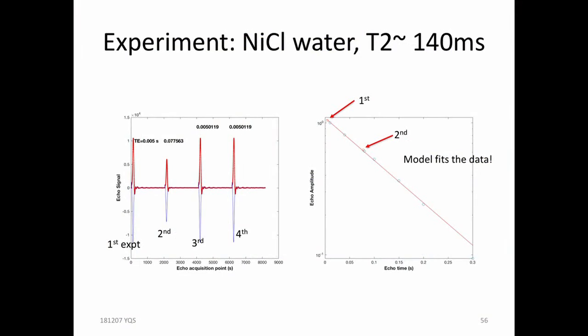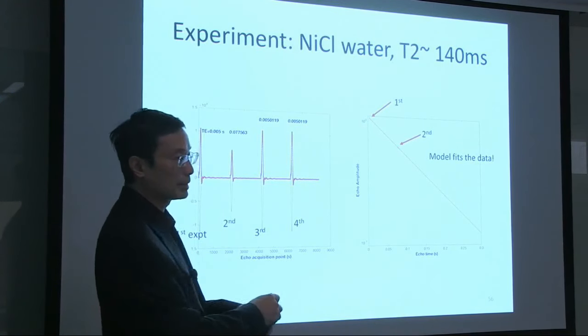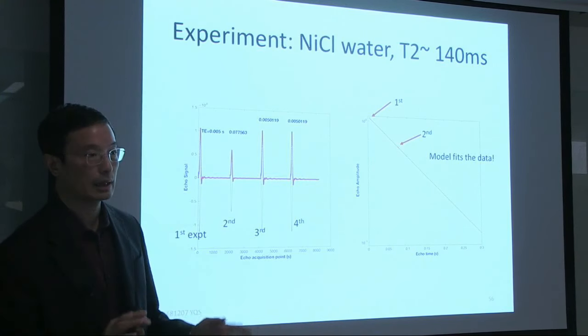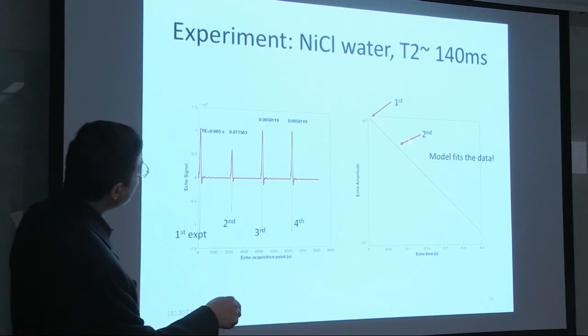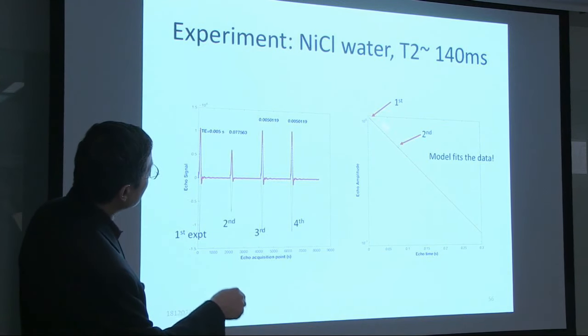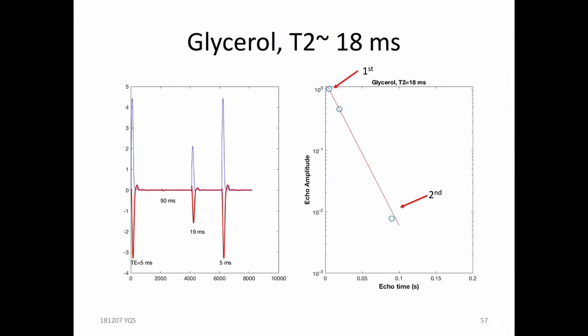And so the first point it measures here, and the second point it measures there. After the second point, it had reached the maximum or the accuracy limits, and you don't actually need to do more. And I just did a few more measurements, the blue points, just to show that these automated measurements are quite okay.